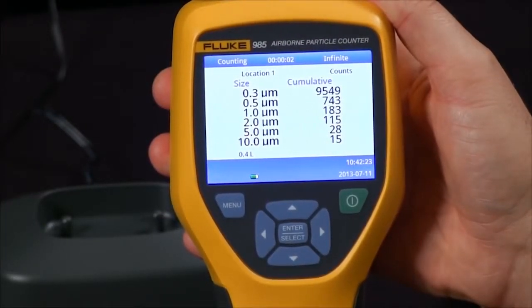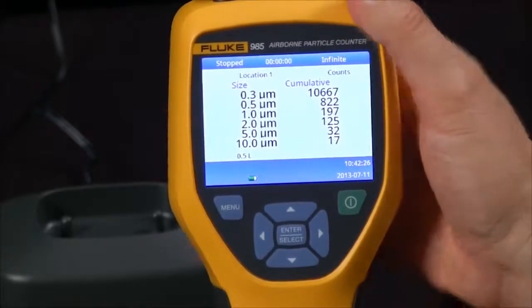Once you have your readings you can simply place the 985 particle counter in the base.